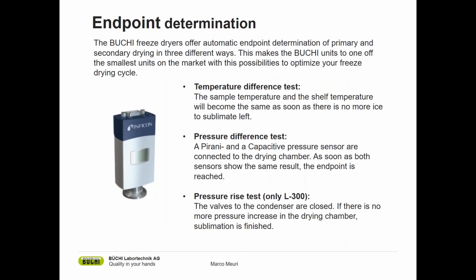If you want to further optimize your process, it's always a question, when is the freeze drying process actually finished? If you have manifold applications, it's quite simple. Once there's no more ice on the manifold or on the round bottom flask on the outside, it means the sample is no longer consuming a lot of energy from the environment and it is most probably completely dry.